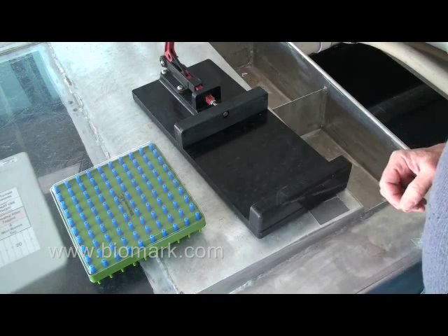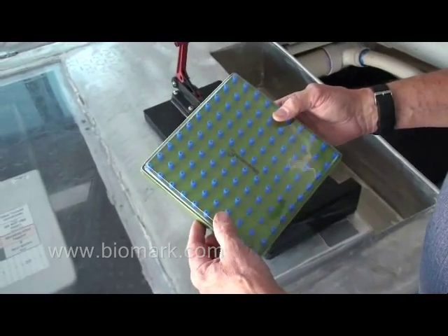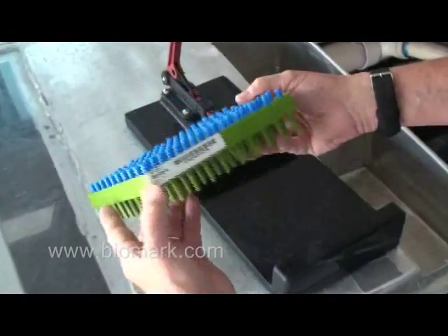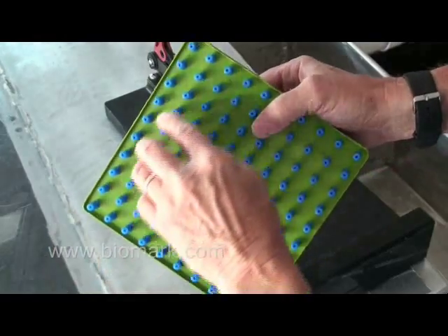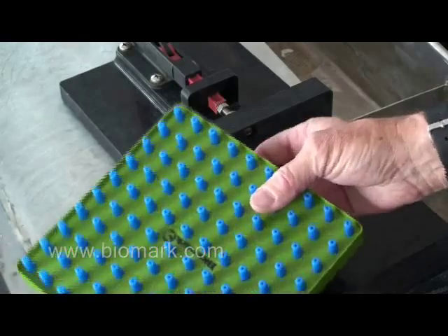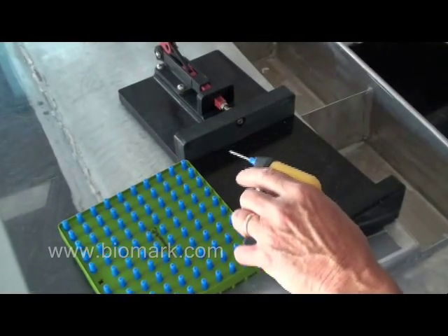Before we get started with the actual tagging operation, there are a few things I'd like to go over to make your job a little easier. The needles are shipped in a 100-pack of preloaded needles. The tray has a cover that can be removed and a label with the lot number on it. The tags are all aligned with a tab facing the same direction so that all the bevels of the needle are facing the same direction. When you extract the needle from the tray, the bevel will be facing in the proper direction to tag your fish.